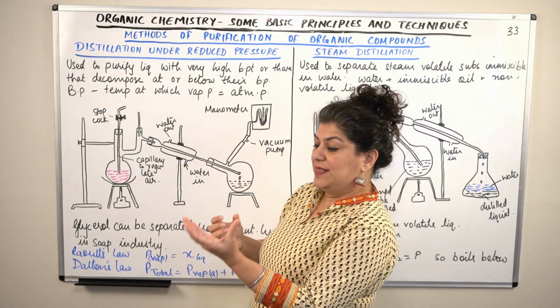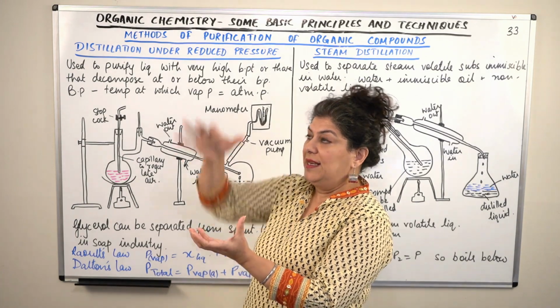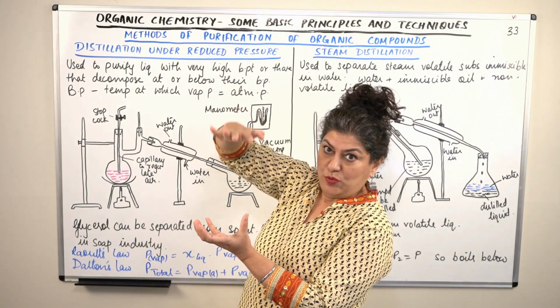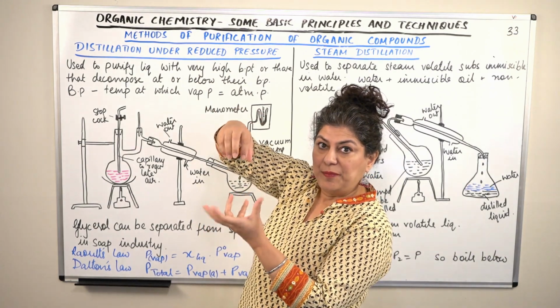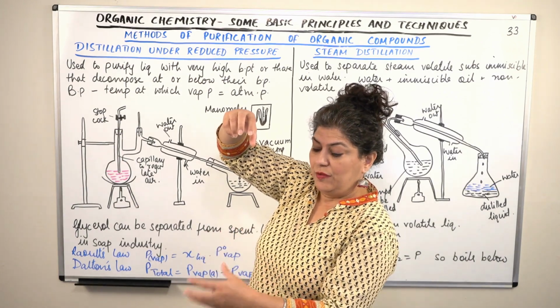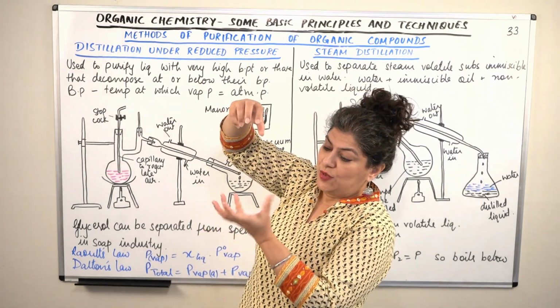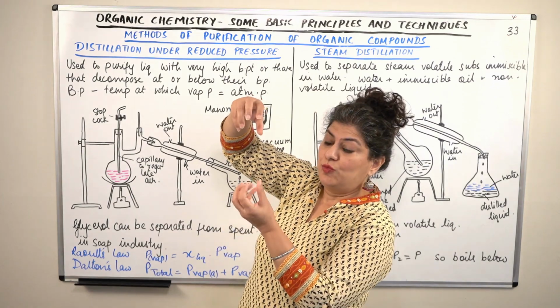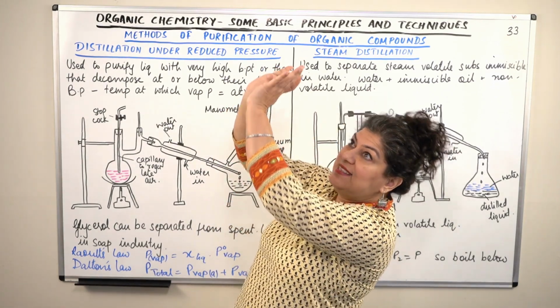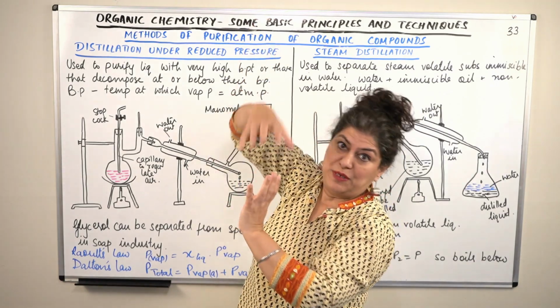When you have a vessel and there is water boiling in it, the gases of the atmosphere are pressing the liquid downwards, and the vapors that are produced due to the energy they've gained from the burner, the molecules that turn into water vapor, move upwards and push against the atmospheric pressure.